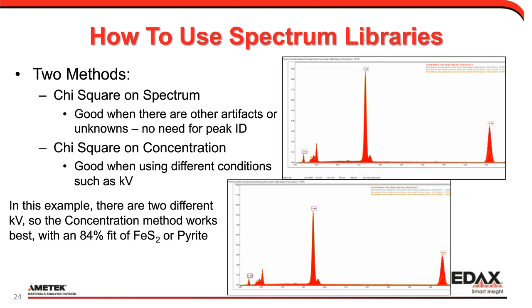But in EBSD, we don't look at the atoms themselves. We look at the arrangement of atoms. And so I'm always having fun with my EBSD colleagues on the definition of a phase. From an EDS perspective, a phase is the types of elements present and the amount of those elements present. But from an EBSD structural phase standpoint, it's the arrangement of those atoms into a crystal form or a unit cell that defines the phase. So yes, we can do EBSD of that material.